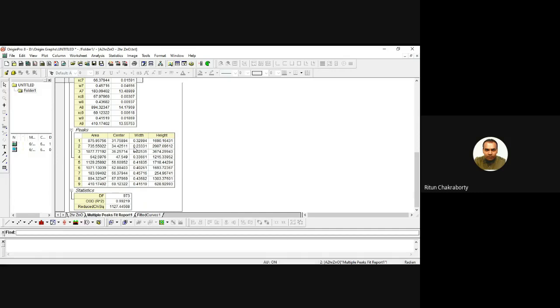I have separately copied the center and width values to an Excel sheet, which I will share with you. One important thing: in the Statistics section, check the R-squared value. It should be close to 1 — the closer to 1, the better the fitting. In this case, R-squared is 0.99219, which is quite close to 1, meaning our peaks have been very well fitted.